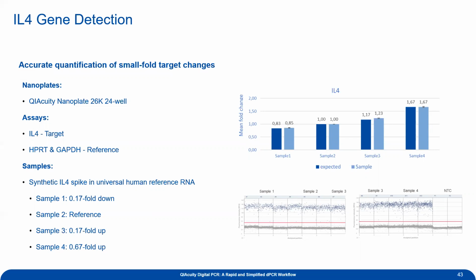And that's due to a number of reasons we won't have to get into today. But essentially, that creates this kind of gray zone of what do you call that, right? Because you have this huge standard deviation associated with your low copy reactions. And so this is where digital tends to be a really good, almost reflexive technique, where you can test on qPCR for your experiments, and you can move to digital PCR if you need more resolution for those low input samples, or you can just port over to digital PCR for your routine experimentation.